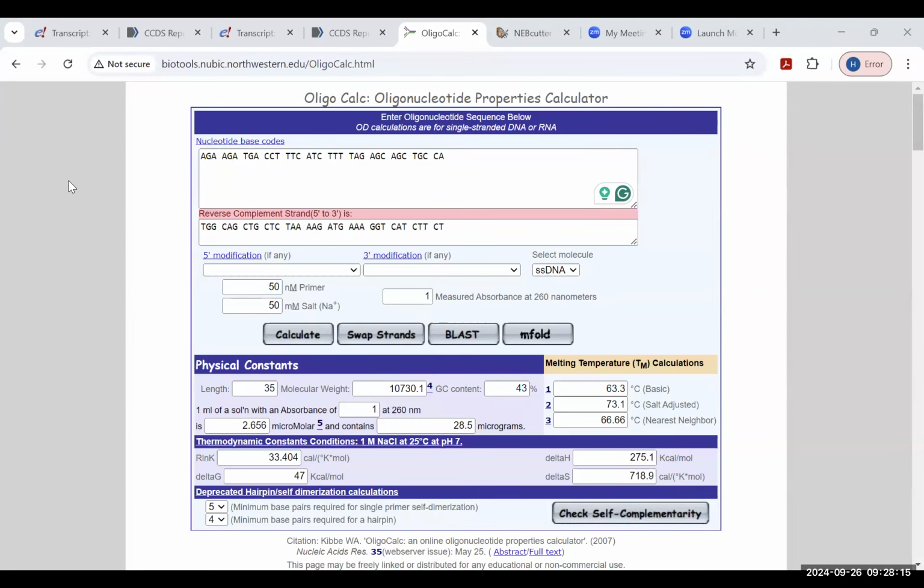The other problem that you can see is the self-annealing, meaning there's a fragment of that primer, which is here, that is gonna anneal, sorry, this part of the primer. It's the exact same sequence, but now this molecule of the primer is gonna bind to that molecule of the primer because of the annealing of those red base pairs. And therefore, when you have this, you have to avoid using the primer if you have a chance. Okay. Be careful just for swapping the strand when you do the reverse, and then it's straightforward.